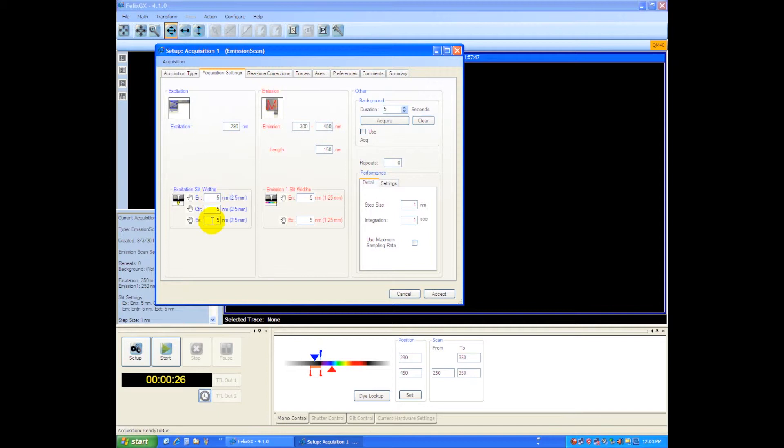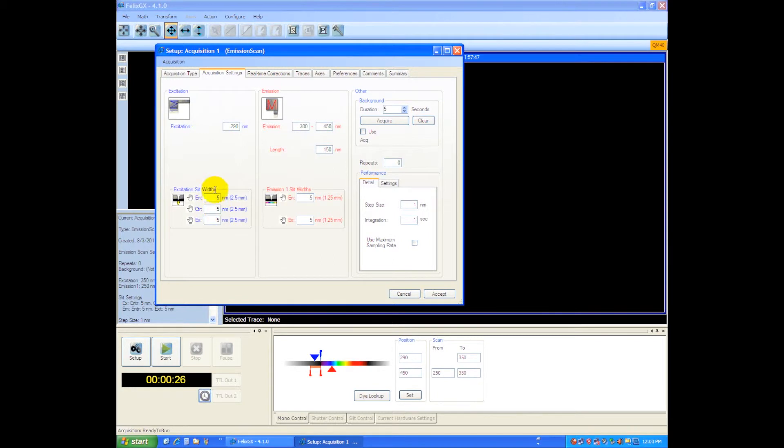This is where you would set the monochromator bandpass, the slit width. I'll just leave these at the default values. These slits are manual control, so whatever entry you put in here is just for your text purposes. If you had a motorized slit, these would control motors and they would set the bandwidth appropriately.